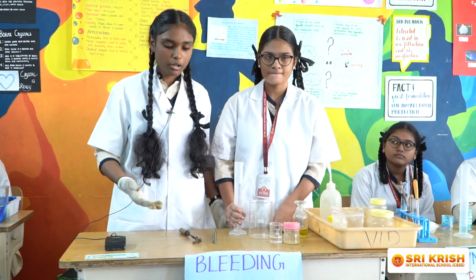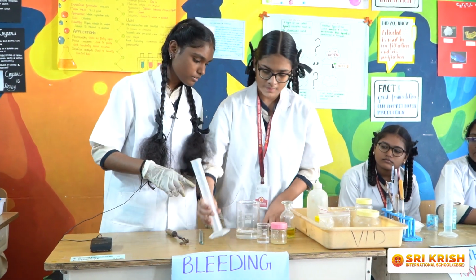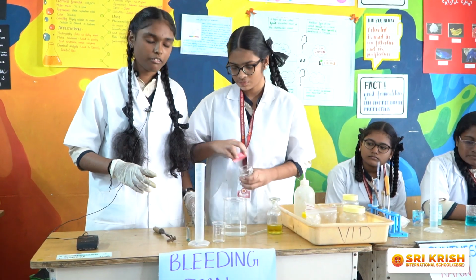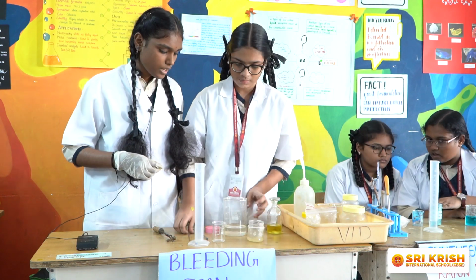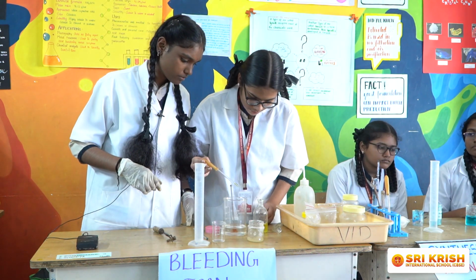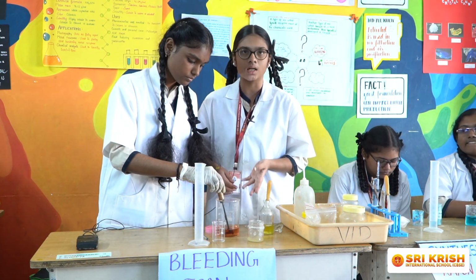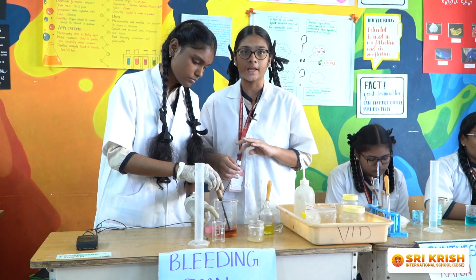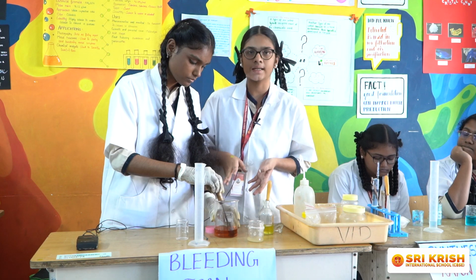Now we are going to do the bleeding iron experiment. We are going to add 90 ml of water, then 10 ml of hydrogen peroxide, then 5 grams of ammonium thiocyanate, then 2 drops of concentrated HCl. When we dip the iron into the solution, it turns red because the iron displaces the ammonium thiocyanate and forms ferric thiocyanate. So only it turns red.